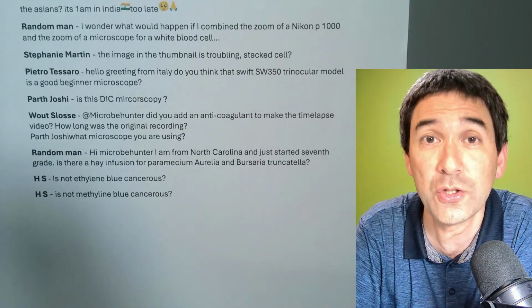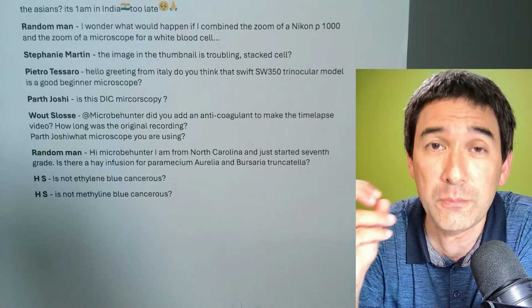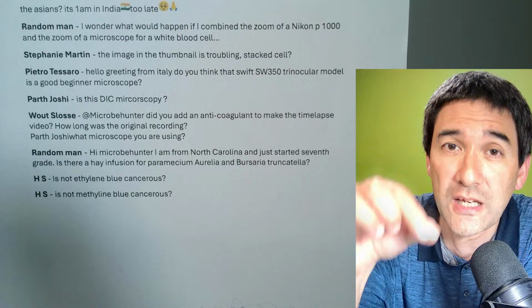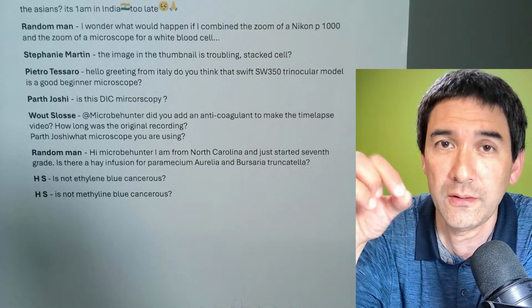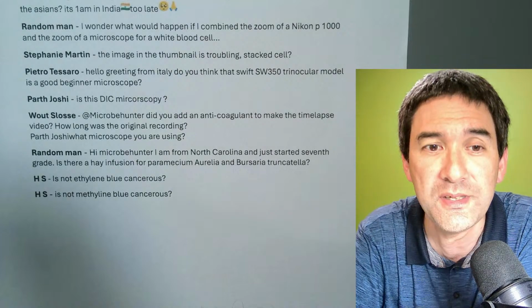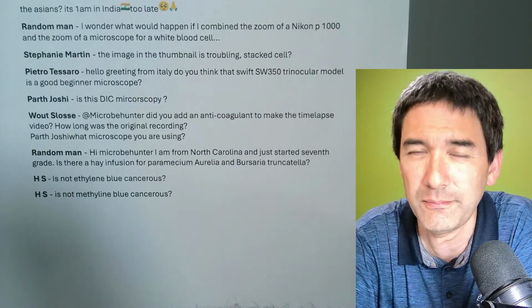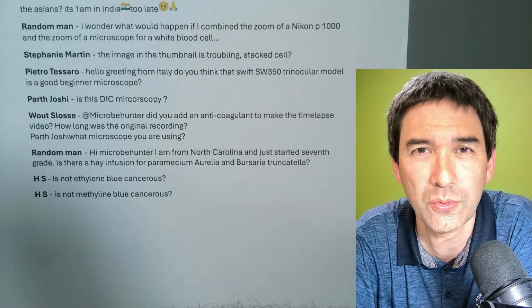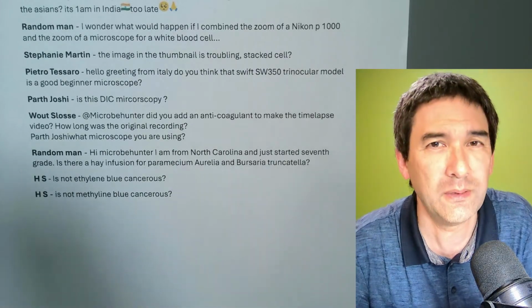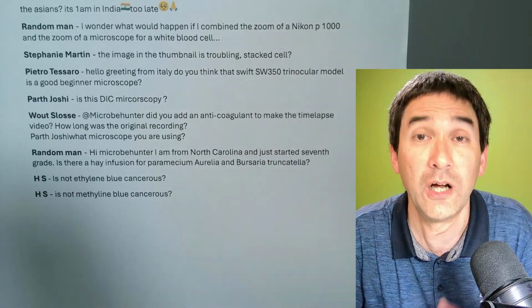And then you're going to have bacteria growing around the wheat grain, and you've also got Paramecia and other ciliates feeding on those bacteria. So when you take some tweezers and carefully lift out the wheat grain after about 3, 4, 5 days, you might be quite lucky to find a lot of Paramecia in there. It's still bacteria, so you might want to be careful. But generally it's better than a hay infusion, which contains even more unknown bacteria.